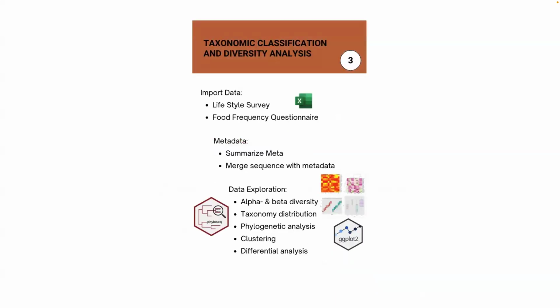In submodule 3, we will integrate metadata and perform in-depth microbiome analysis. Microbiome data becomes far more meaningful when combined with metadata, information about the samples, such as dietary habits, lifestyle factors, and physiological characteristics. This helps us understand how different factors may shape the gut microbiome.